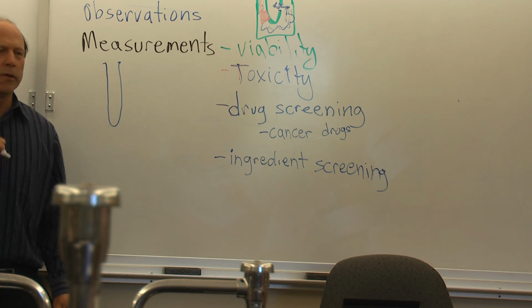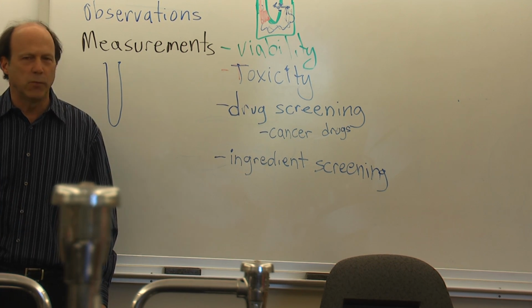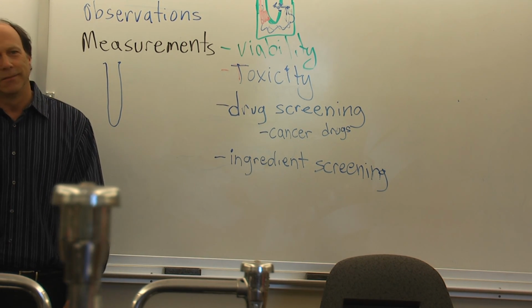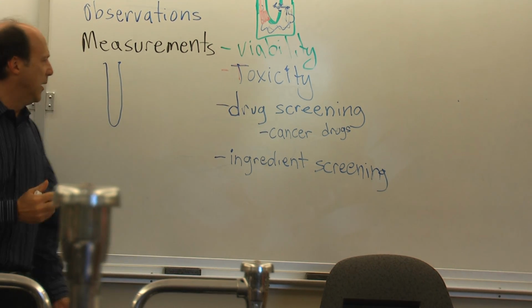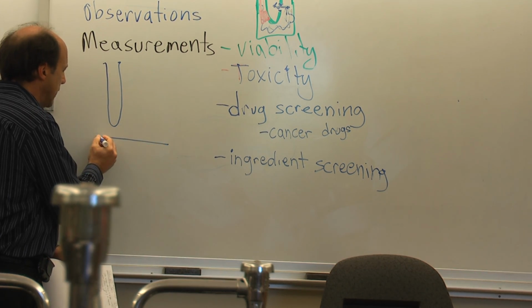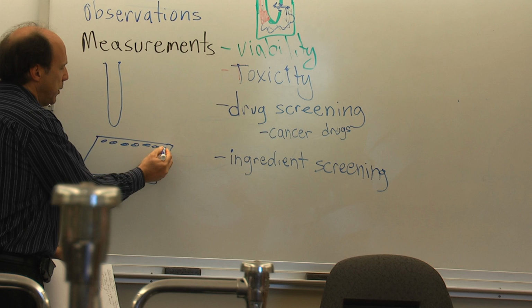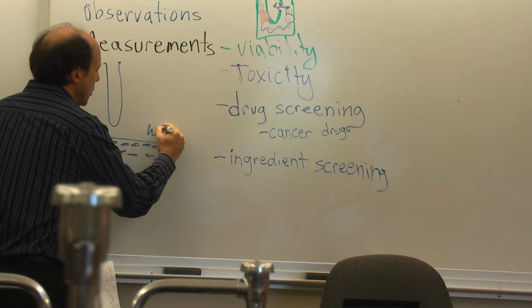We live in a world where everything has been made using a microchip, right? The electronics have been shrunk down to a tiny little etched circuit on a silicon wafer. So instead of a test tube, biology is trying to move in that direction too, into the micro stuff. So we use these plates, and these are multi-well plates, and they've got these little indentations we're calling wells.